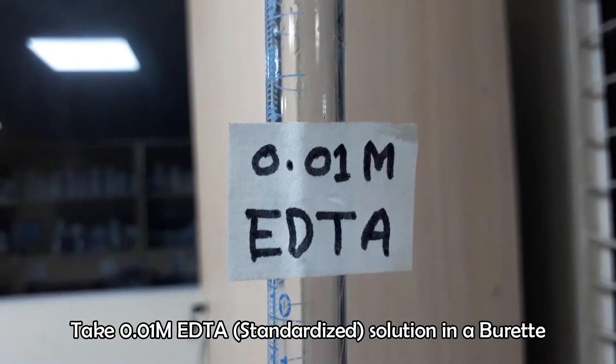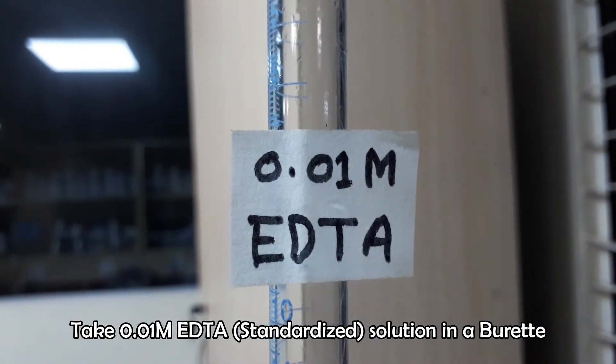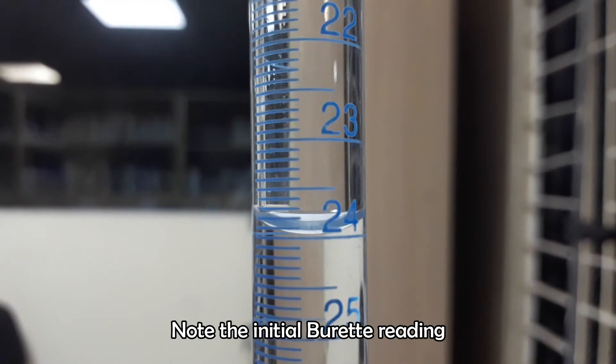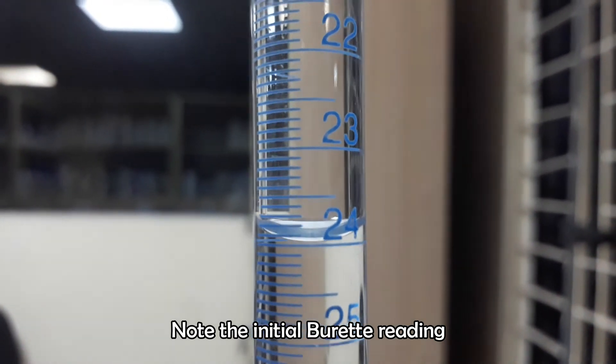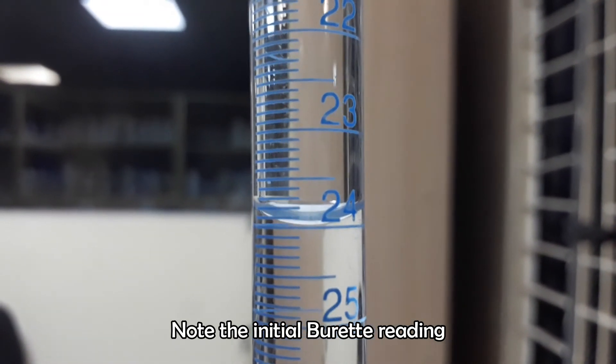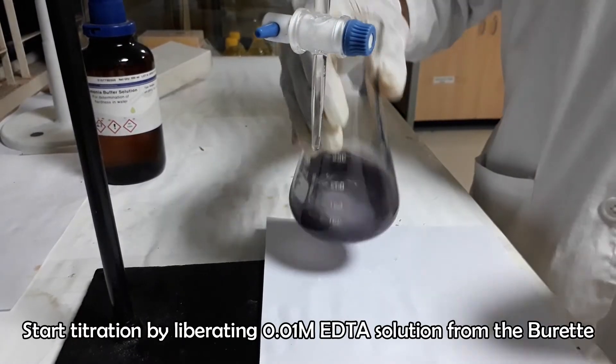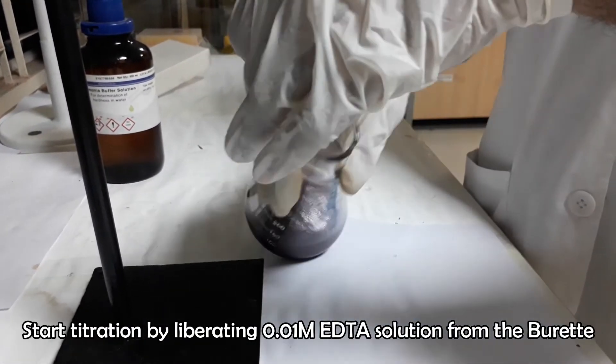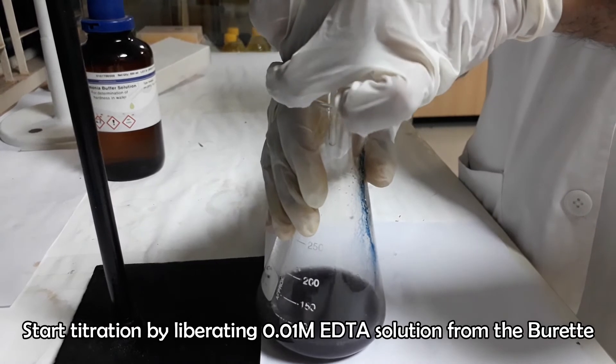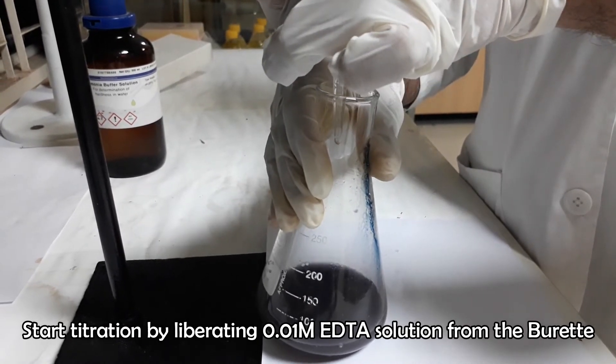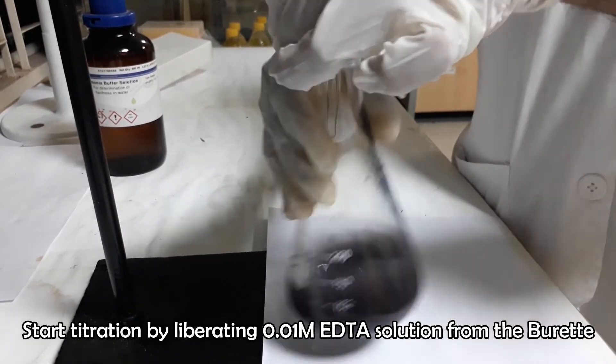Take 0.01 molar EDTA solution in a buret. Note the initial buret reading. Start titration by adding 0.01 molar EDTA solution in the flask drop wise from the buret.